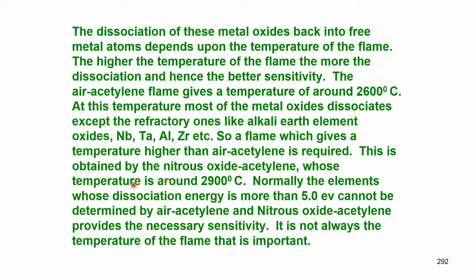that apart, the nitrous oxide acetylene flame is around 2900 degree centigrade, and it is better for us to understand that whenever there is possibility of oxide formation, go for nitrous oxide acetylene flame. Normally, the elements whose dissociation energy is more than 5 electron volts cannot be determined by air acetylene. This is a general rule. Any element whose dissociation energy is more than this, we suggest go for nitrous oxide acetylene, that provides the necessary sensitivity.